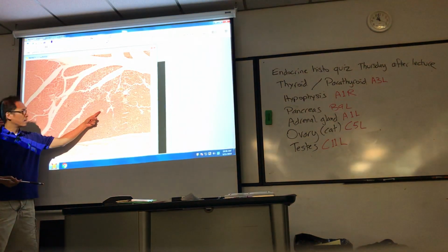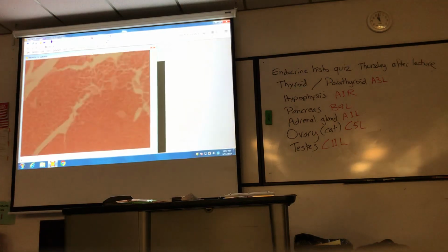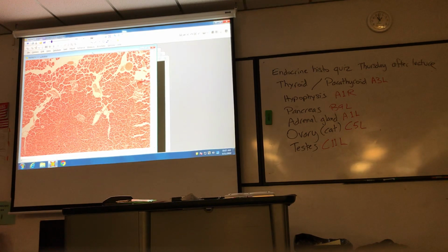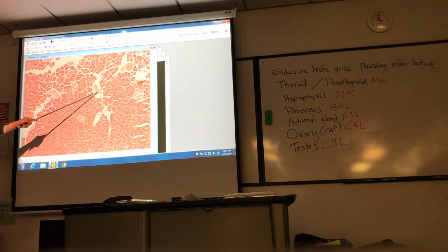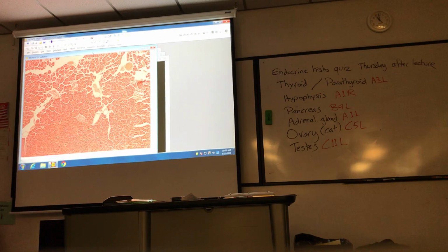See that? Maybe you can't. Let's go to higher mag. Now, if you see little dark nuclei, those are a clump of cells. If you see something with a big lumen, that's red blood cells in a blood vessel. That's probably pancreatic duct. This is what we're looking for. Let's go to high mag. That's a pancreatic islet. Those little tiny islands of cells responsible for insulin and glucagon.